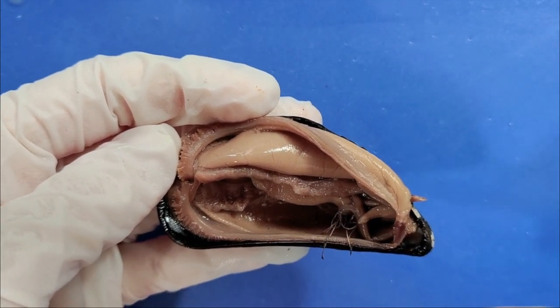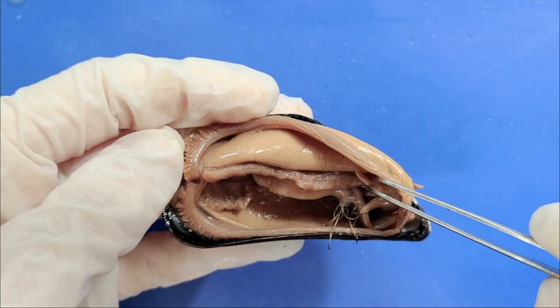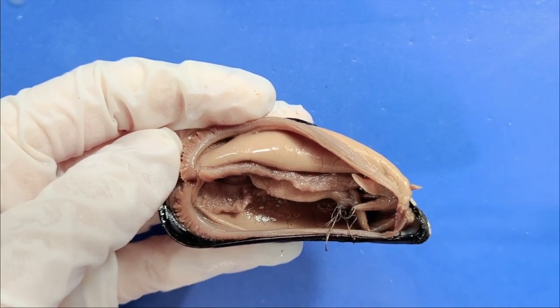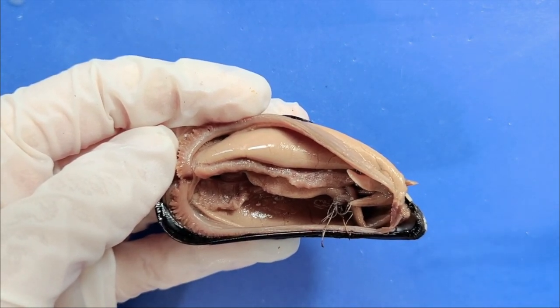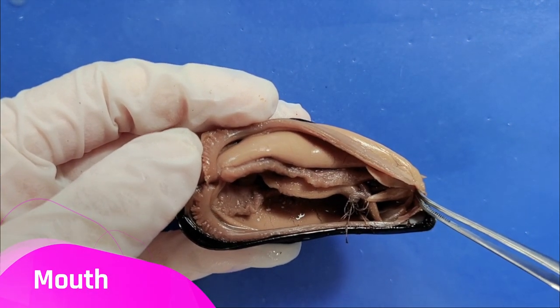These food particles then travel to the labial palps — this little paddle-like thing right here, and there is another one here — which pushes the food into the mouth. So they're kind of like the lips. The mouth should be somewhere below the labial palps, but it's hard to see.